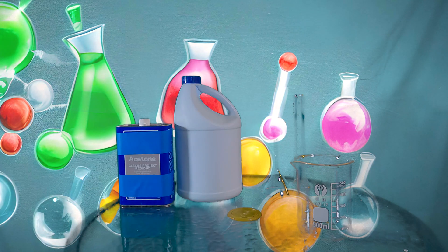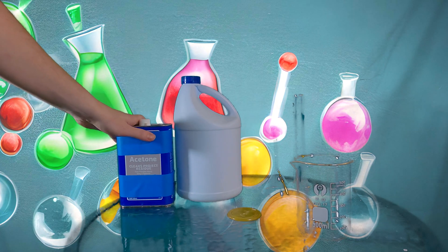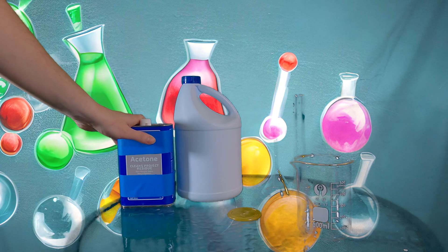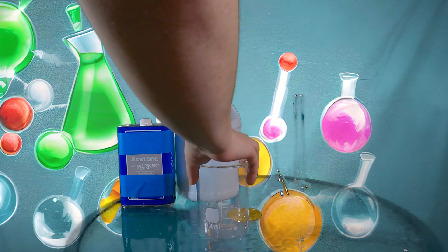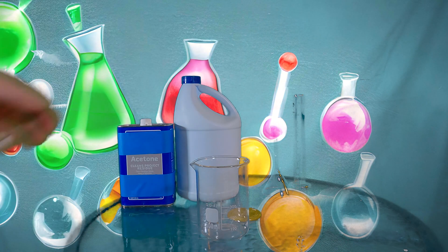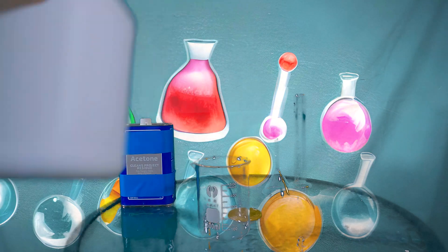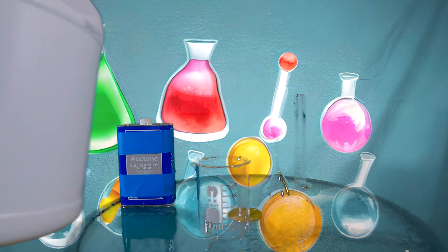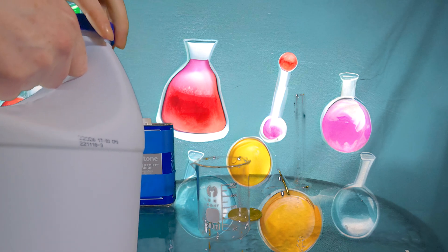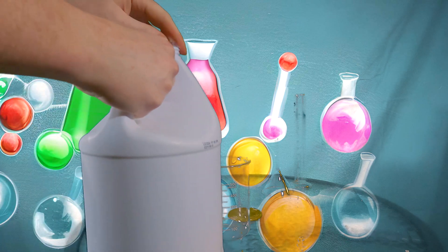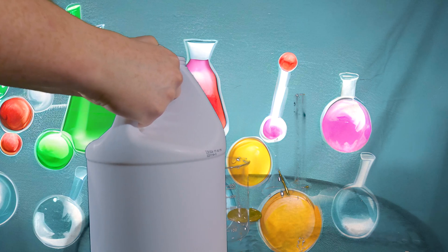Alright, welcome to the government watch list — I'm glad you're here. We're going to need to make some chloroform to make carbon tetrachloride. So what I'm going to do first is pour out an amount of bleach to make room for our acetone. We're just going to be using bleach and acetone here. Getting this uncapped with a fresh bottle of bleach.